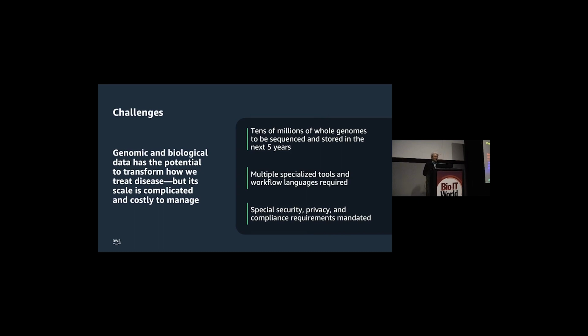For instance, you need optimal ways to store all that genomic data that are cost efficient and easy to access. You also need tools to analyze trends across millions of individuals, perhaps train ML models. And then you need to scale that compute across millions of biological samples while preserving accuracy, reliability, and managing costs, as well as security, because a lot of this stuff is pretty personal. It is your source code, so you do need to keep security, compliance, and privacy in mind.